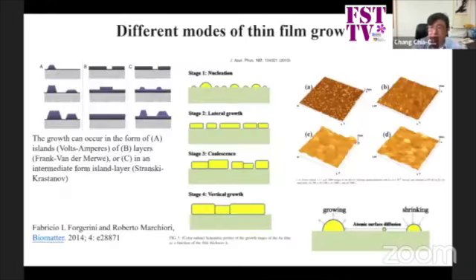So we try to develop a thin-film electrode by a metal sputtering approach. Conventionally, the growth of the metal sputtered on the surface may follow different growth mechanisms. However, as I mentioned, if we want to conjugate the biomolecule with the metal surface, nanostructures such as nano islands will be better.